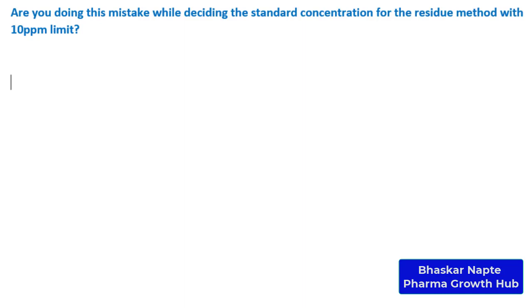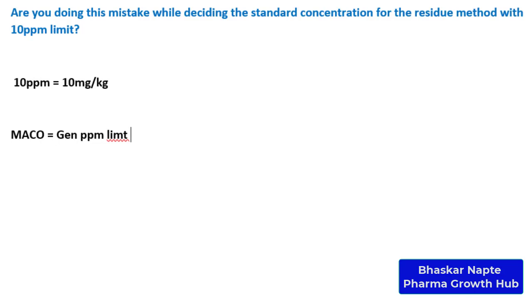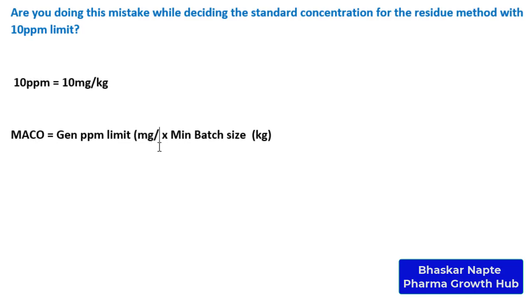The general ppm limit we are considering is 10 ppm. Can I express 10 ppm in another unit? Yes — 10 ppm is nothing but 10 milligram per kg. The MACO under the general ppm limit approach is calculated as: MACO equals your general ppm limit multiplied by the minimum batch size of the next product in kg. The general ppm limit must be expressed in milligram per kg, giving MACO in milligram.